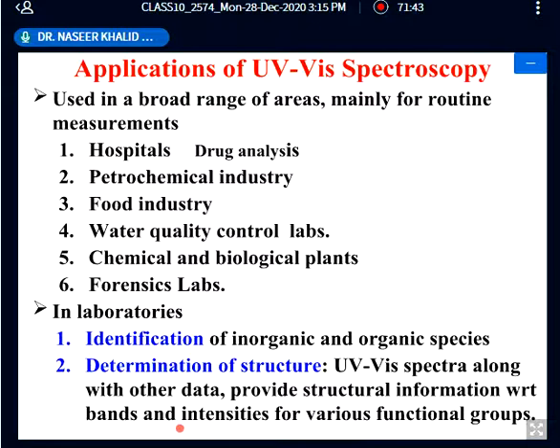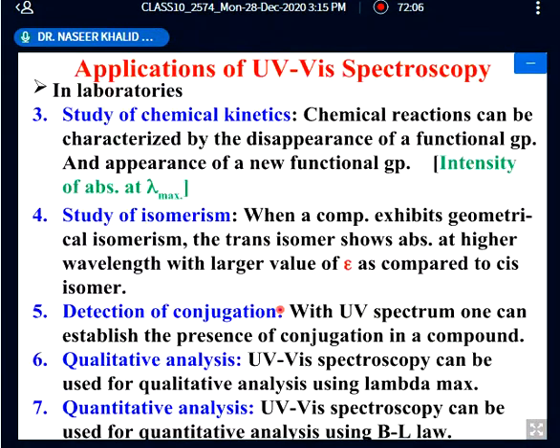From the wavelength and the intensity of the bands, we are able to determine the functional group of a material. Especially, for example, when you are going to synthesize a new compound, this basic raw data is a must for the identification.